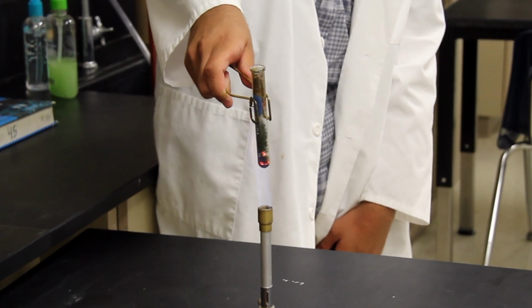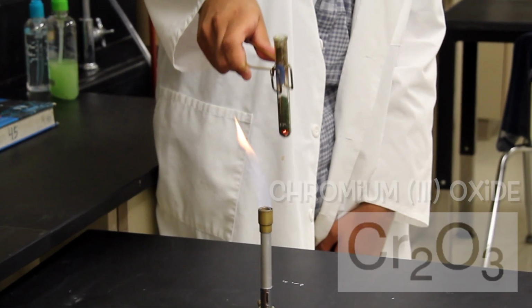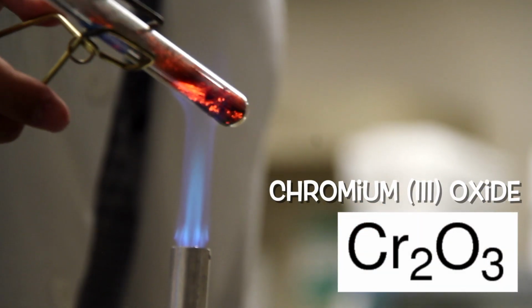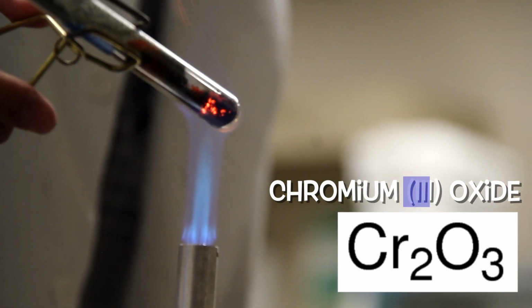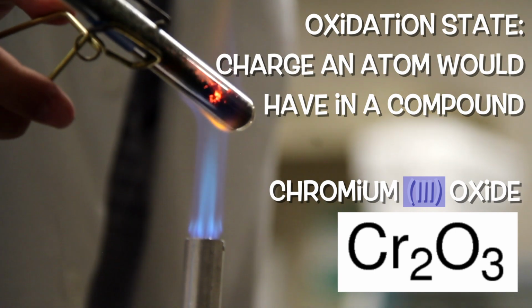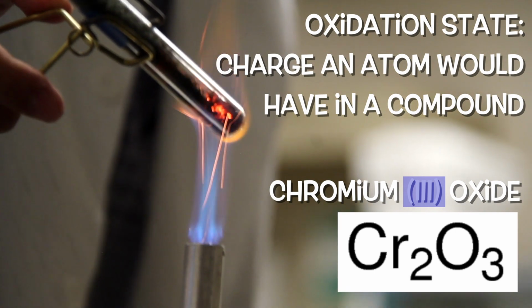The orange solid begins to give off sparks and decompose into chromium-3 oxide. We give transition metals, those are metals in the center of the periodic table, Roman numerals after their name to identify their charge because these metals are capable of having different oxidation states. So chromium-3 has a charge of +3.